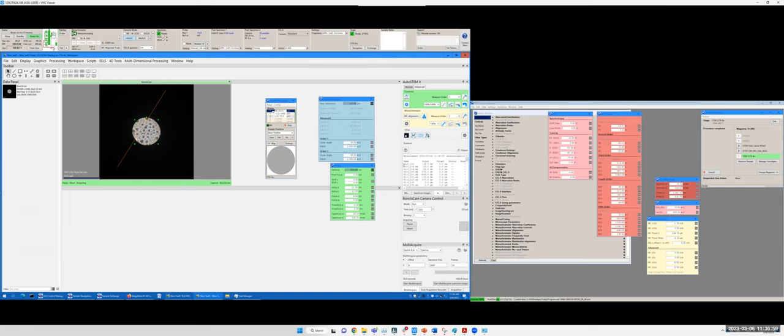Okay, now you will see the name is different, right? The name is slit. It means the aberration in the monochromator. And then you can click fix. When you move your mouse here, you can see a hint of what's happening: correct aberrations up to first and second order. Okay, click. And you can see the beam changed a little bit. Okay, so that's good.